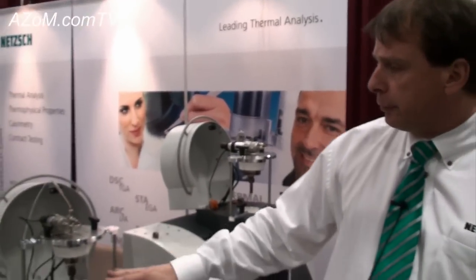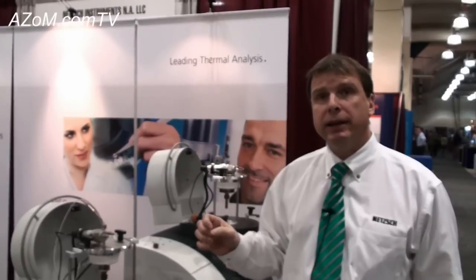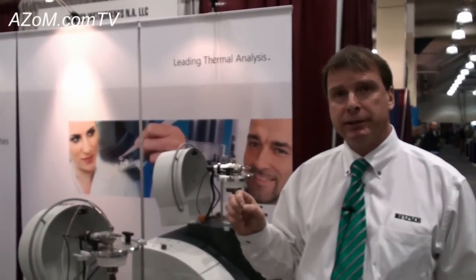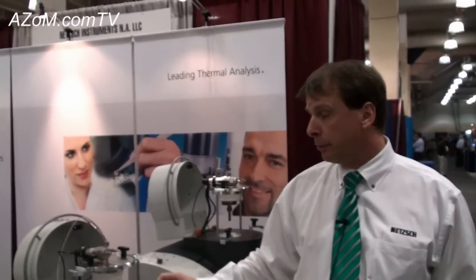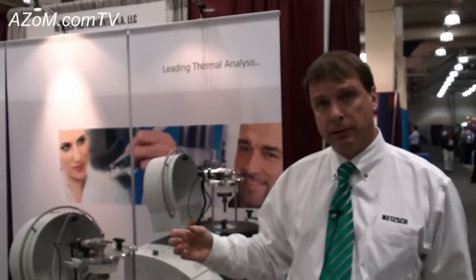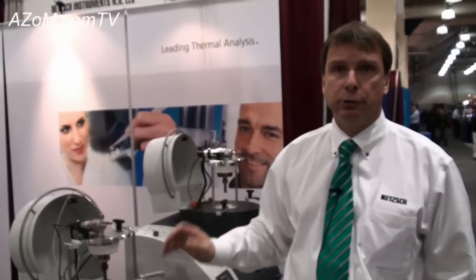We have another module, which looks very similar, that can do very fast tracking — monitoring very fast runaway heating rates. We also have a feature called the verify option, which can actually input heat into the sample, and there are a lot of good applications for that. The advantage of this mini ARC, or mini accelerating rate calorimeter, is that you can do scanning or very fast screening tests. On a full-scale accelerating rate calorimeter those processes can take days, whereas with this we can do it in a matter of hours.